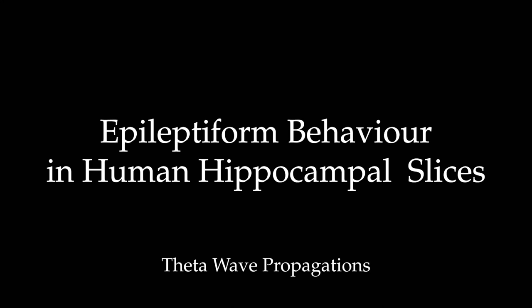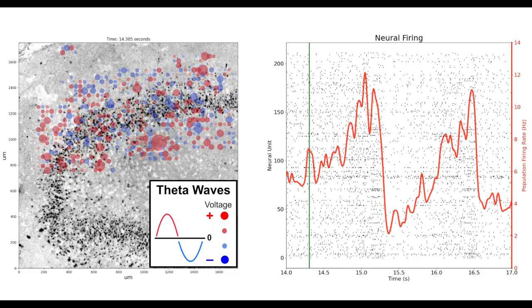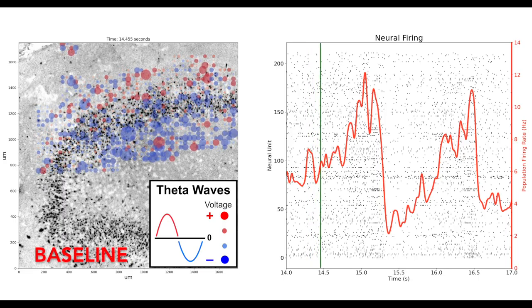This video displays the theta wave dynamics of a thousand electrodes recording from human hippocampal brain slices at the onset of seizure-like activity.